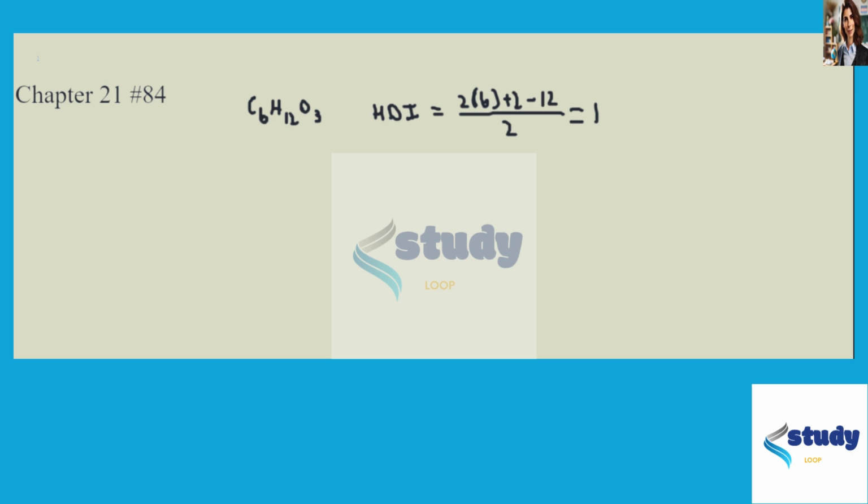The next piece of information we're given is IR. At IR, we have a peak at 1718 wave number, and that should tell us carbonyl, so C double bond O. That also fits with our single degree of unsaturation. So that's good. Then we need to look at the NMR, and this NMR is given to us.